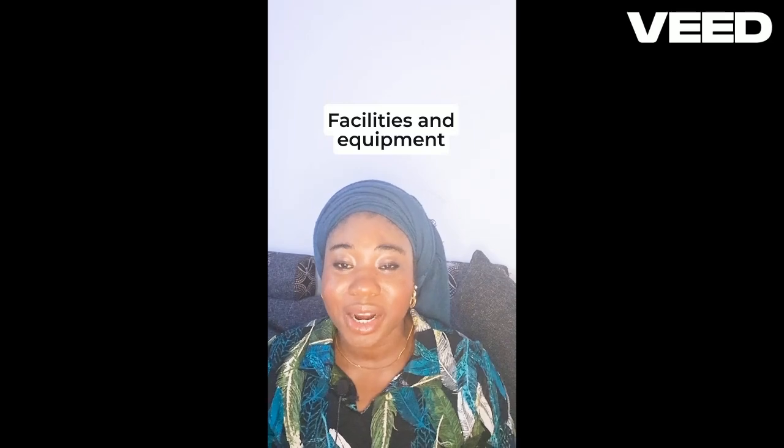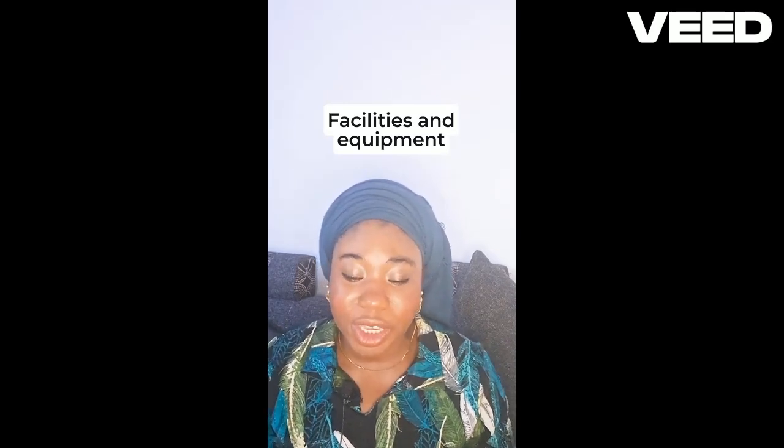Also, facilities and equipment is another characteristic. Facilities and equipment involve the mandatory use of appropriate facilities and equipment to conduct studies, including laboratories that are designed and maintained to minimize the risk of contaminants and ensure the safety of personnel.